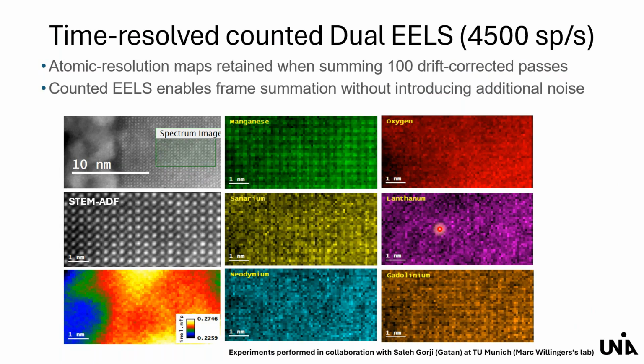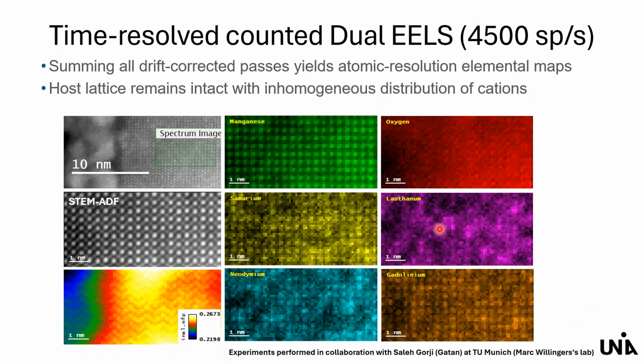What we have not done yet is to evaluate the first 100, the next 100, the next 100 to see this. But I guess we can do this soon, and it will confirm this, because if it doesn't change from 100 to 700, just contrast and noise level is getting better.